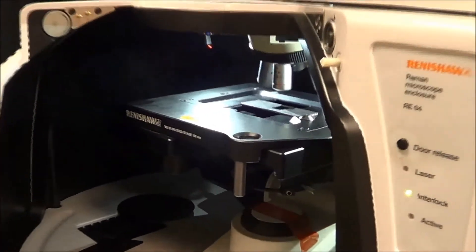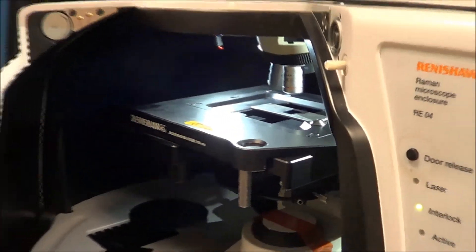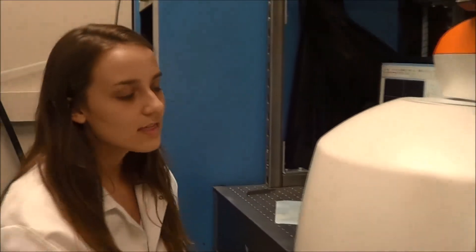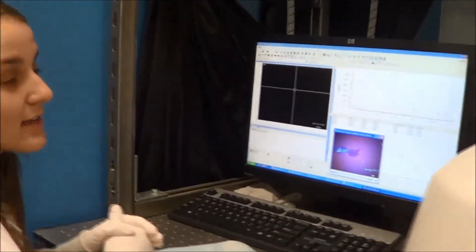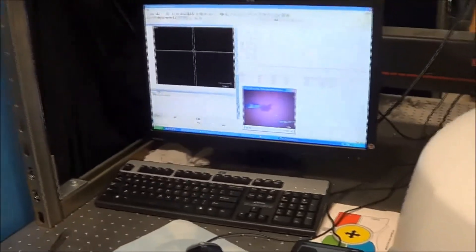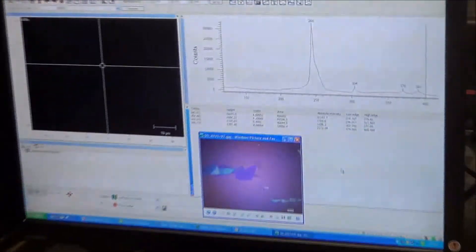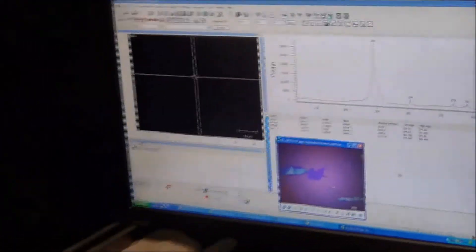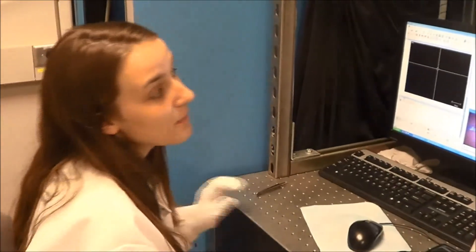The next step in characterizing our flake is by using the Raman tool. Here, I have uploaded my sample into the chamber. This tool works based on the principles of Raman spectroscopy. These peaks help give us a fingerprint of the material loaded, which in our case should be MOSE2 and help identify how thick the material is by giving us a fingerprint of each individual layer.